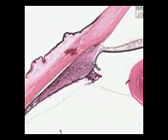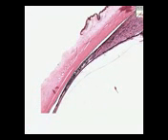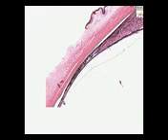I think when you see a retina, you know the 5 or 6 different kinds of cells in classical layers you could get there. Also notice that we have a lot of blood vessels here. And also notice that here's that RPE coming all the way down eventually towards the retina, but also notice we don't have a retina.